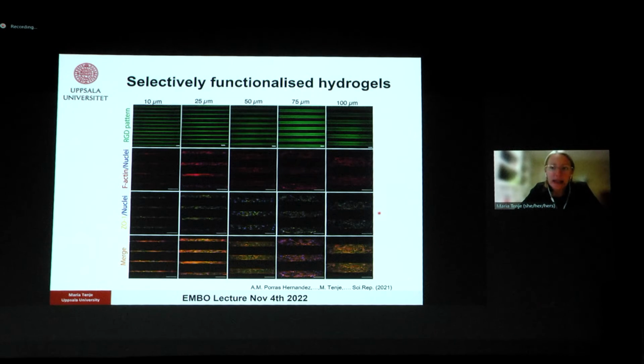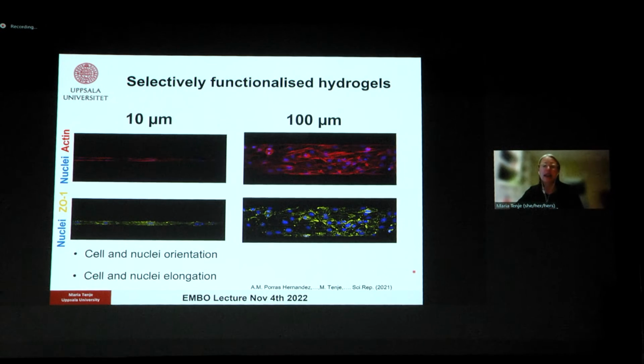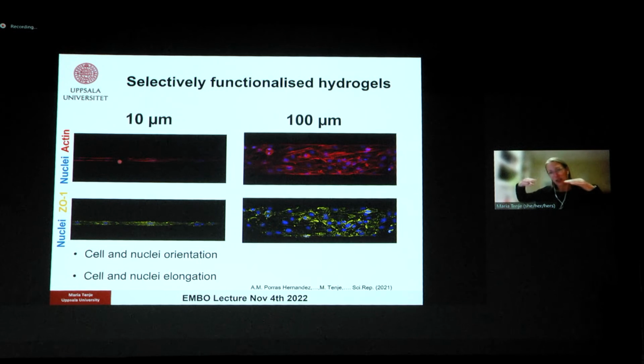Looking specifically at and comparing the thinner lines to the broader lines, you can see quite a few differences between these. So first of all, there are obviously fewer cells on the thinner lines, but also the cells sort of align, so they fit just one by one next to each other, and they form a very thin structure. Whereas on the thicker lines, you have multiple cells that sit next to each other.